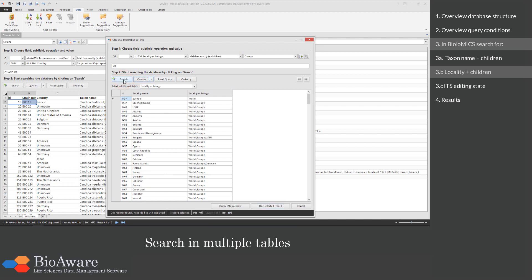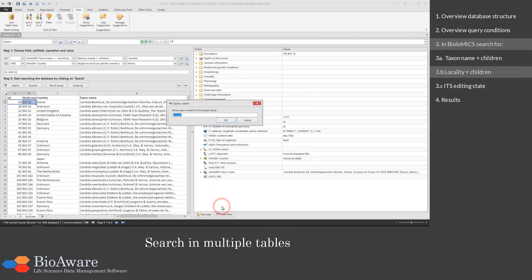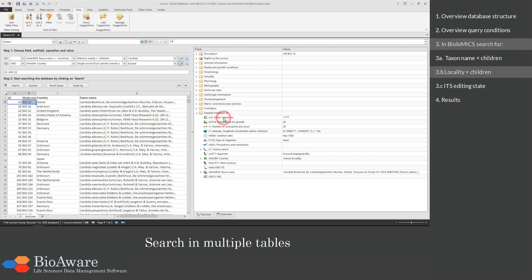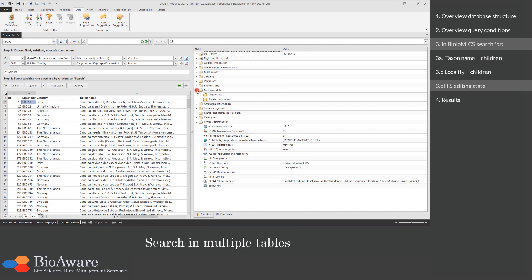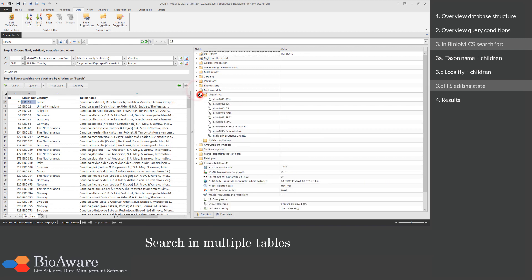We found 242 records and we will add them all to the query. The last condition is to search in the ITS sequence field.